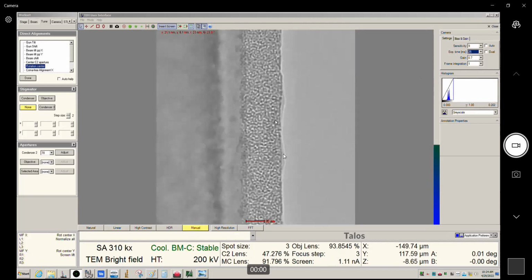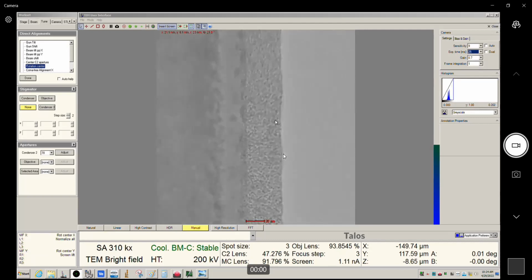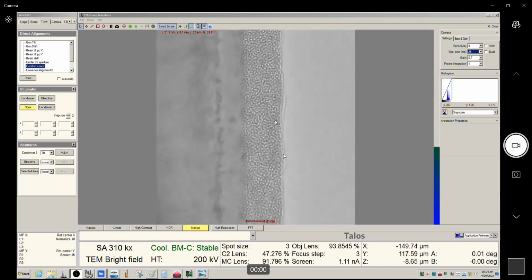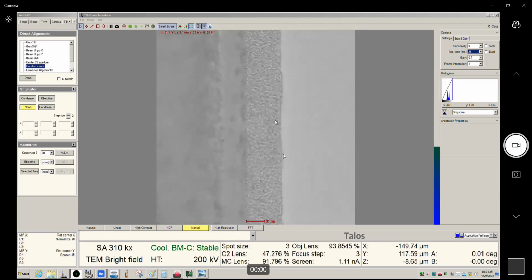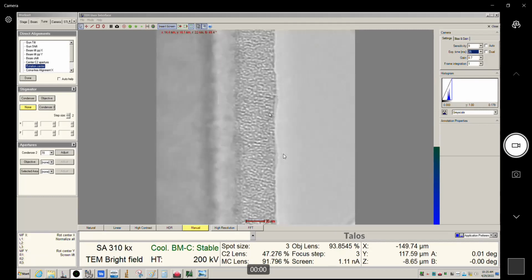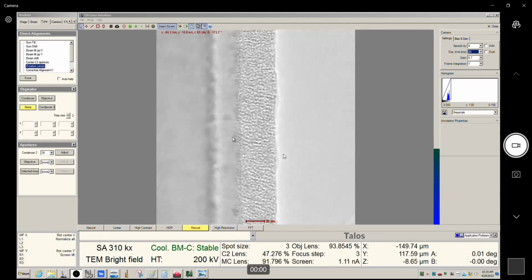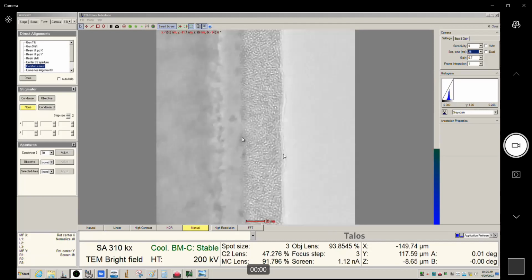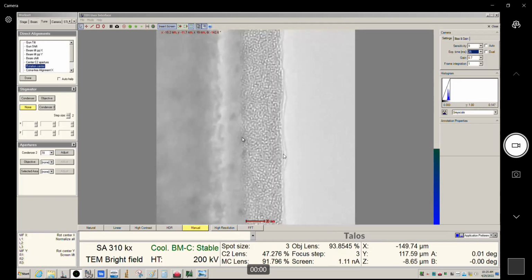So again, the normal way of doing this is you're minimizing the image shifting with the multifunction knobs. You can see here my image is shifting. Now, this can be kind of tricky to do here because we have these long linear features. We can use the FIB platinum here. So you can now see it's going side to side, and you're trying to minimize this.